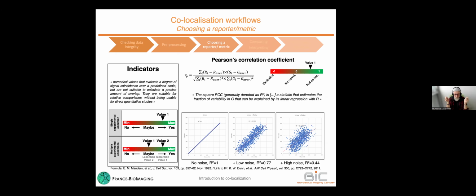You will take the pair of intensities for a single pixel located in the same place, and put them on a plot using the intensity of channel 1 as X and channel 2 as Y. You will end up with this kind of graph, which is called a cytofluorogram.